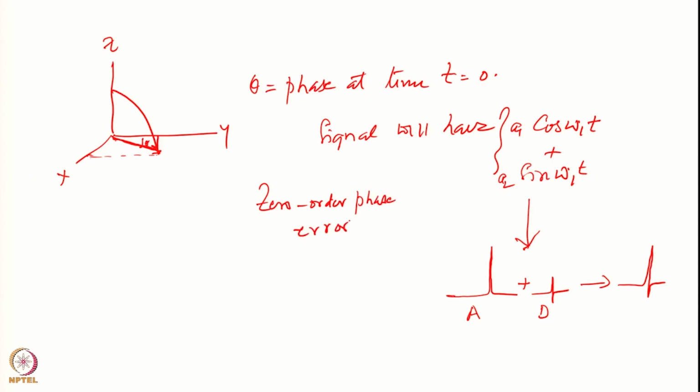This is because it is not dependent on any frequency; the entire magnetization is rotated. So at time t equal to 0, all the magnetization components have the same angle, all the components have the same phase error.